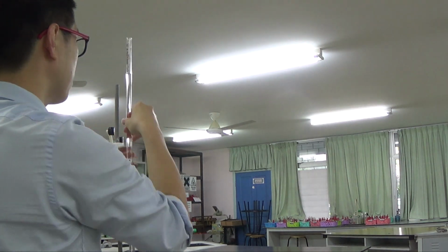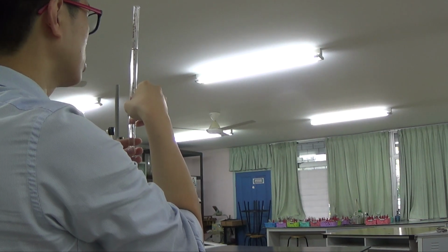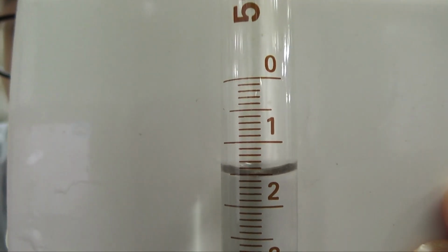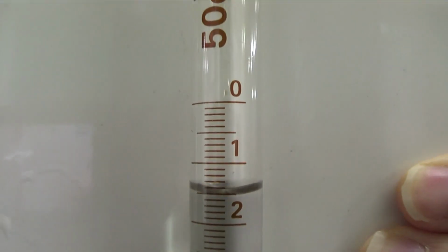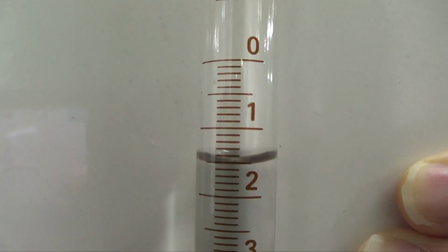My initial reading on the burette is to 1 decimal place. Reading below the meniscus, there's 1.6 cm cube. Just to convince you, there's 1.6 cm cube. You don't necessarily have to start from 0.0. You can start from anywhere, but of course your teacher might advise you to start from a number that's easy to count. I have my calculator. I'm an experienced chemist, so I don't care where I start because I roughly know where to count it.